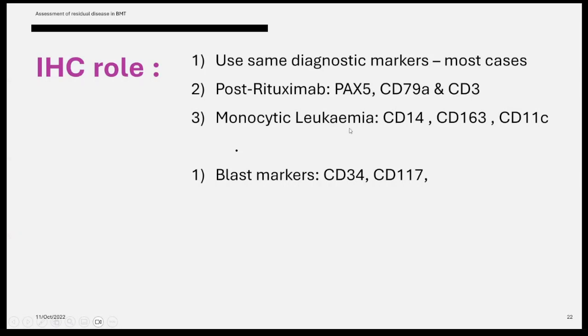And for monocytic leukemia, it is recommended to use CD14, CD163, or CD11c. I'm not sure whether Queen has already got these markers or not. Dr. Nasir has to confirm this one, CD11c. And for blast markers, apart from TdT, we use CD34 and CD117.